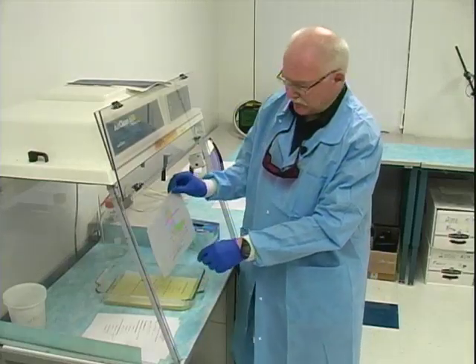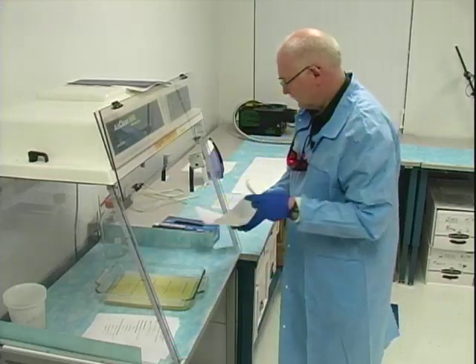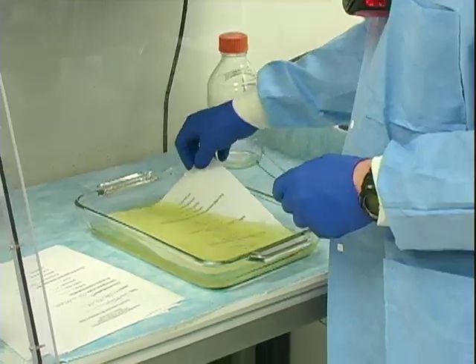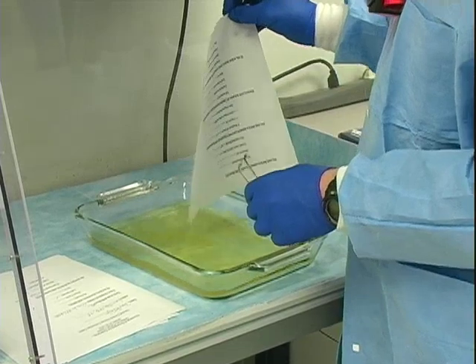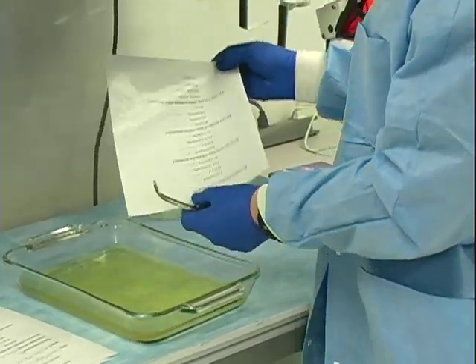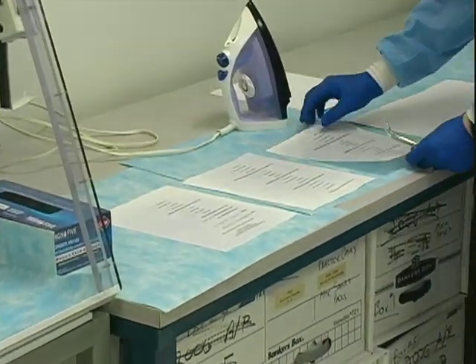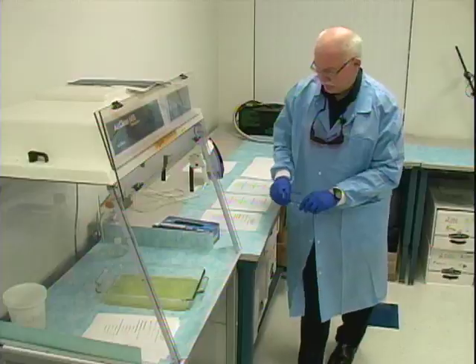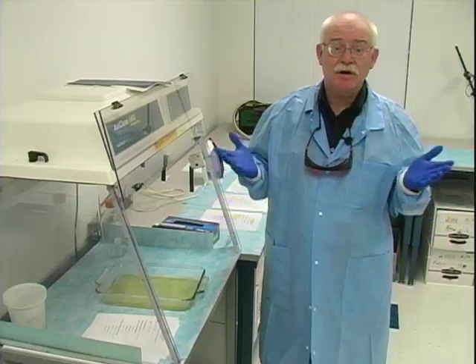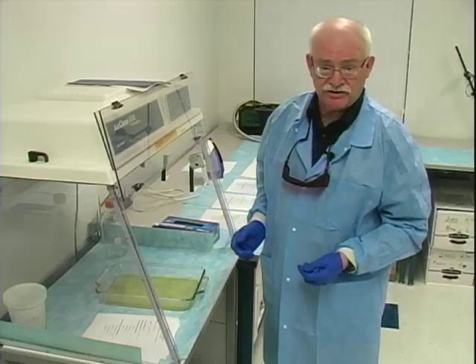The solvent of choice is HFE 7100. This is a very environmentally friendly solvent, and it dries very quickly. In my experience, it has not had a negative impact on ink. That concludes the very simple process of treating these exhibits in the first stage with the amino acid reagent.